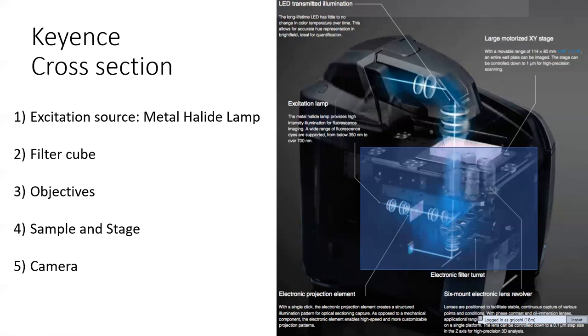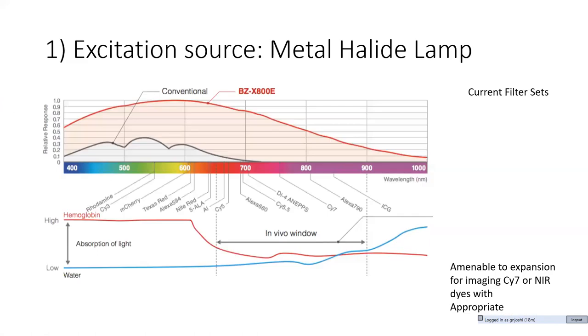So what I'll do in the next few minutes is break down each of these points, talk a bit more about them, and any of the technical details which are important for you to understand in relation to how this will affect your image, okay? So first is the excitation source.